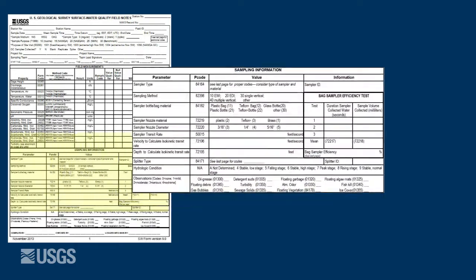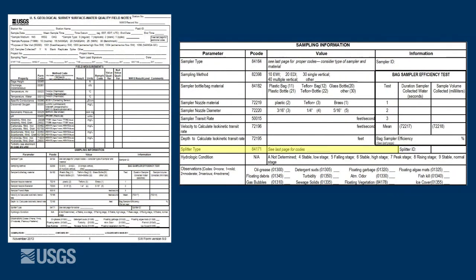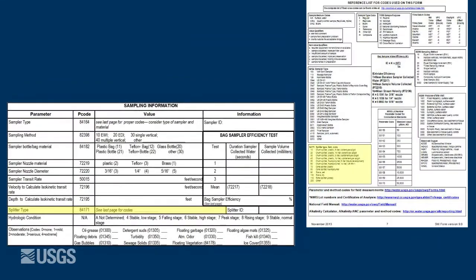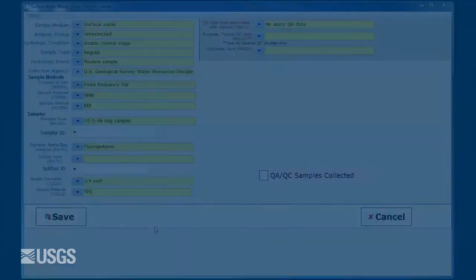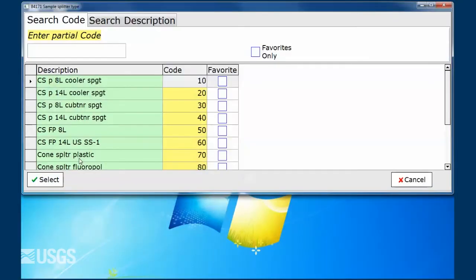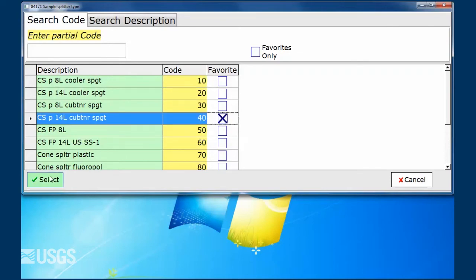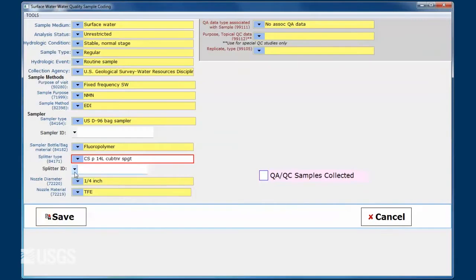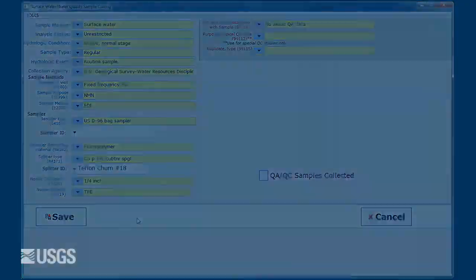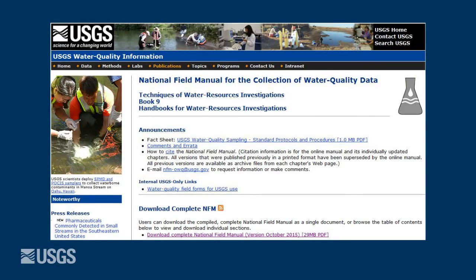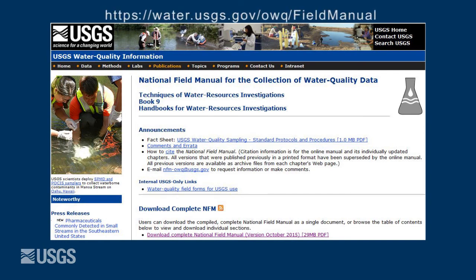Complete the field form and notes to document the type of churn used. For additional information regarding selection, cleaning, collection, processing, and churn splitters, see Chapters 2, 3, 4, and 5 of the National Field Manual.